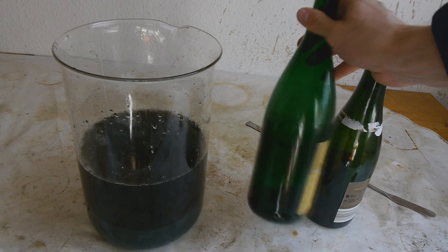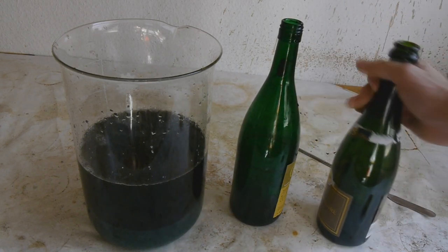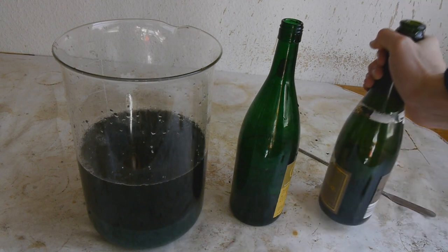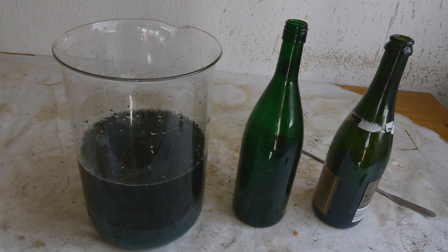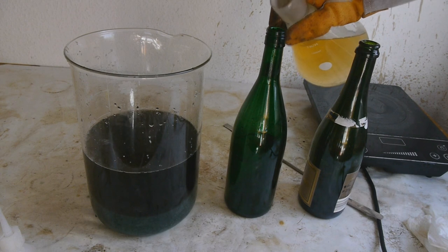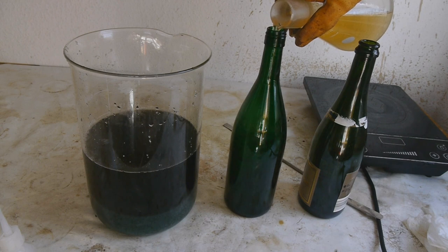These bottles still have a lot of crystals in them that are stuck because the opening is too small. So in order to get them out, we can use hot water, which actually dissolves them quite easily. Alright, here we have some hot water. It's discolored because it's also contaminated with iron, but it obviously doesn't matter.